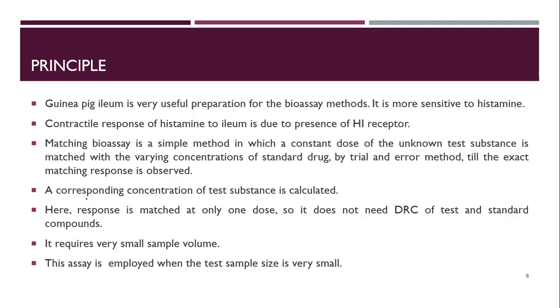The reason is that the guinea pigs are very sensitive to the actions of the histamine. So it becomes very easy for us to observe the effects the histamine produces on the various tissues. Okay, so the contractile response of the histamine on ileum is due to the presence of H1 receptors.